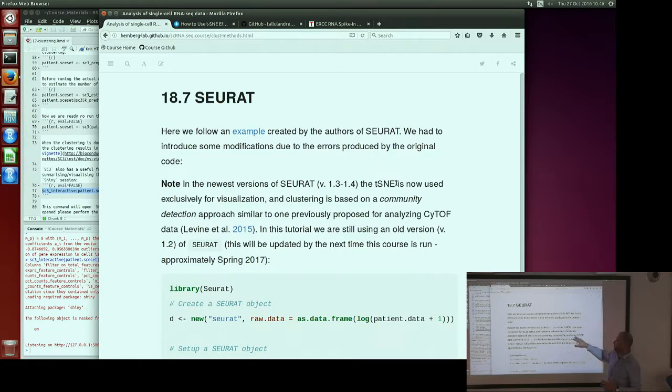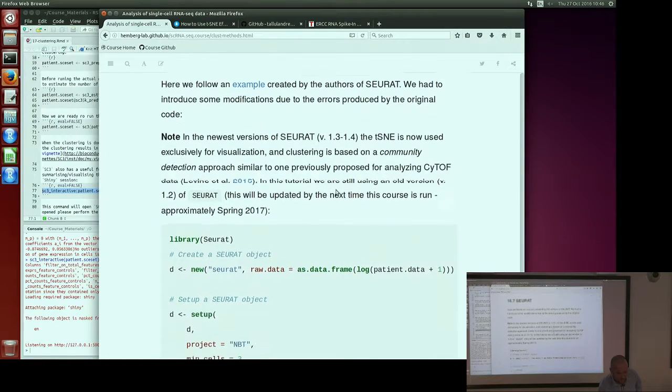I think they use the same algorithm as was used for Drop-seq data from this paper. Because they didn't provide any benchmarking, I can't really tell you whether it works the same way or it's very different. They just say that they changed it. However, I'm going to concentrate on the previous version because I didn't have time to update to the newest one.